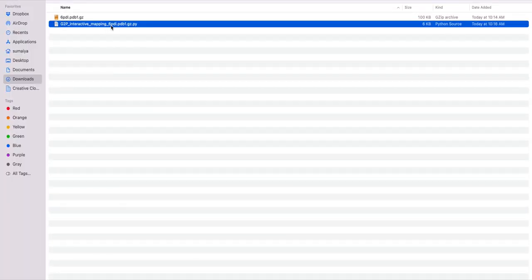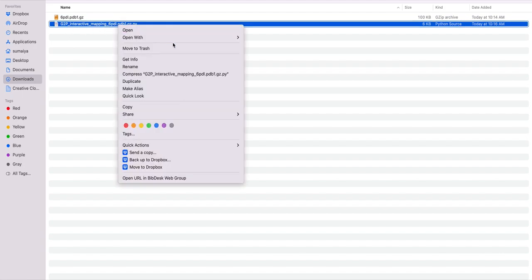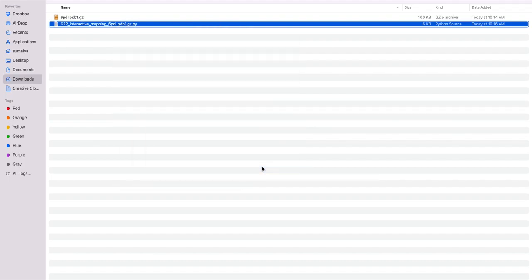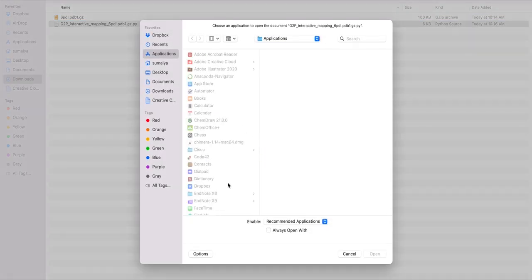So the file, the annotated file, has been saved in this name 'G2P interactive mapping' and then the structure identifier. I will open it using PyMOL.